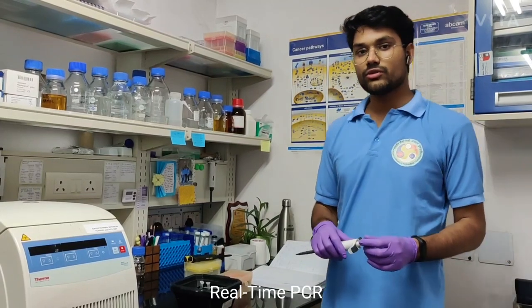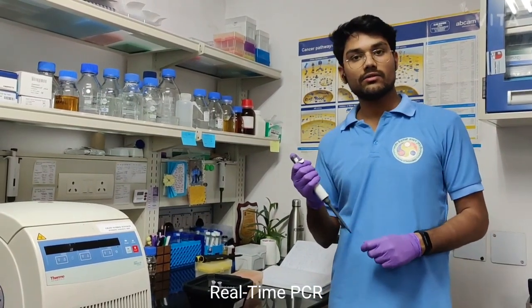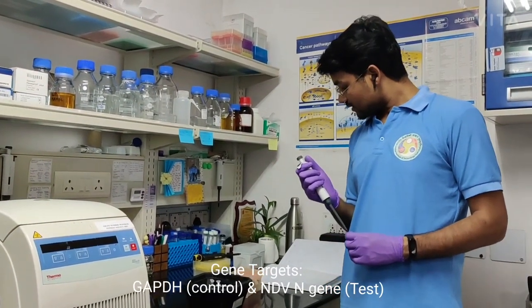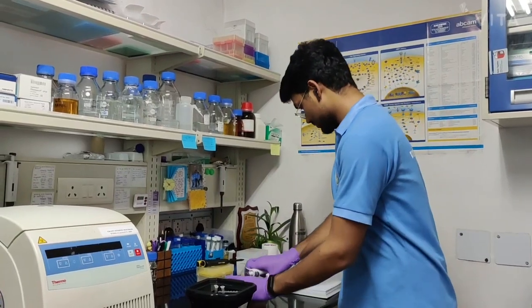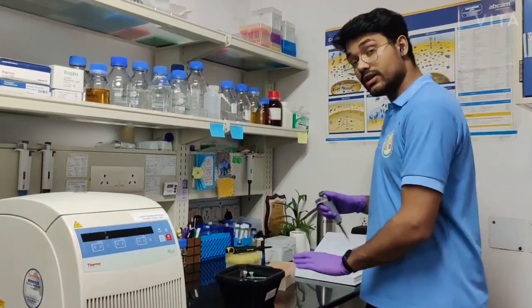In this video, I will be showing you how to do the real-time PCR of the cDNA that we have recently prepared. So my targets will be GAPDH and some virus primers. Like in this case, I am using the NDV N primer. All the reactions I will be doing in triplicates.